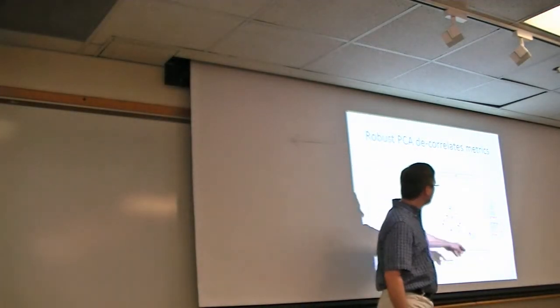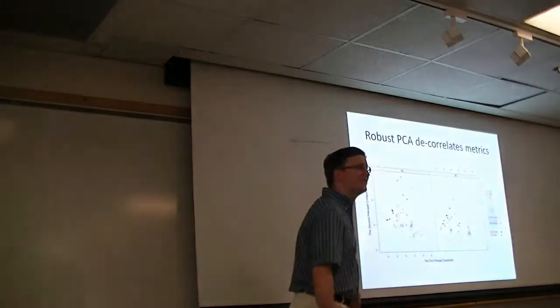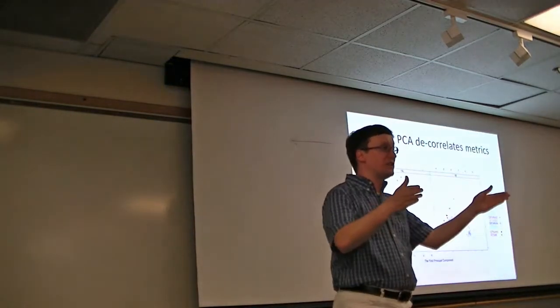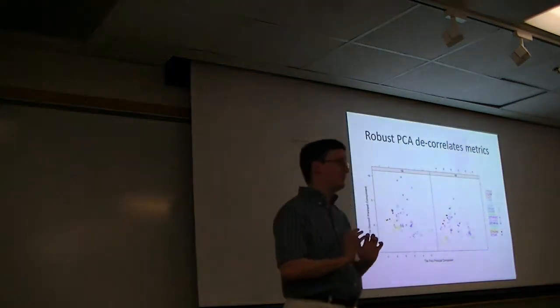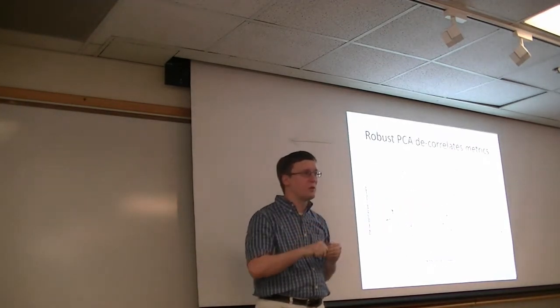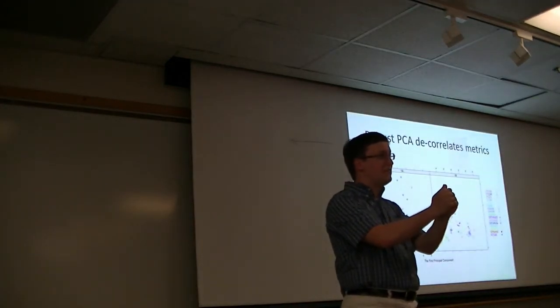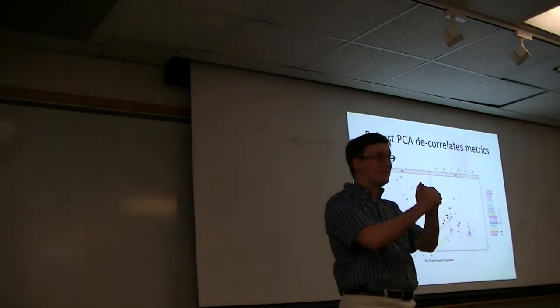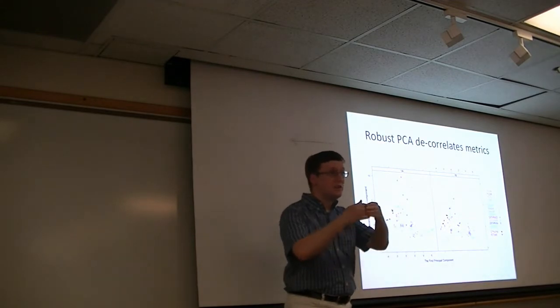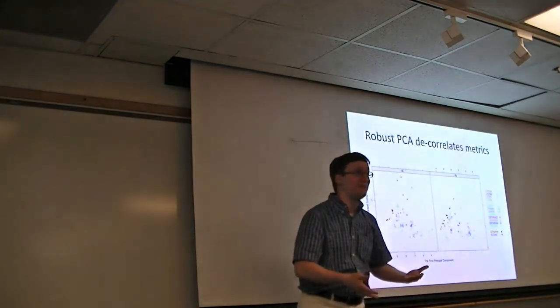So here we see instruments like LTQ-B at site 65. I don't mind telling you guys, that's us, right? So here we have each of these different experiments. So we're looking at the quality control metrics represented in principal component space. So each raw file is represented by this vector of 40 numbers produced by Quameter. Some of those metrics are correlated with each other, and as a result, they can be combined in a single principal component. So principal component analysis is dealing with all the correlations, the pairwise correlations within these metrics to figure out which ones actually explain some variance.